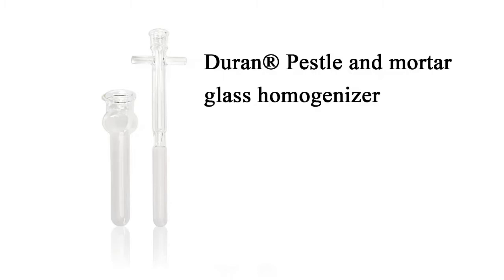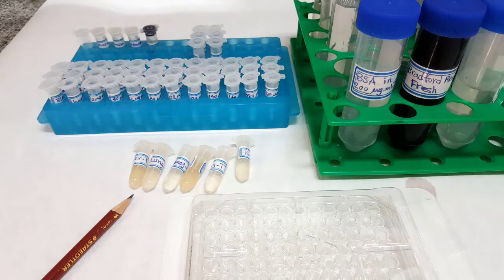Alternatively, you can use a stainless steel mesh screen with a 200 mesh. The homogenates were centrifuged at 5000 G for 10 minutes. The supernatants are used for measurement of protein concentration.